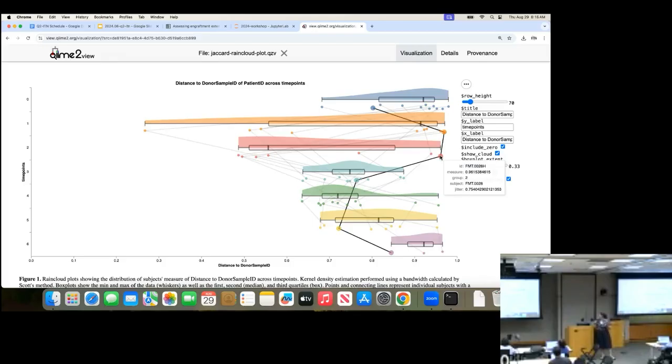It seems like they don't have, oh, this is a tricky dot because it ends up in the exact same spot that we were expecting our line to be, but they don't actually have a time point 4. You can kind of tell that by the fact that there's a green dot that overlaps the line, but it's not made bigger when I scrolled over it. But so they, in their time point 3 and time point 5, trend towards the donor, which is a great sign. And then at time point 6, they trend away from the donor, which again, may be a sign of not stability, may be a sign of them emerging their own unique microbiome.